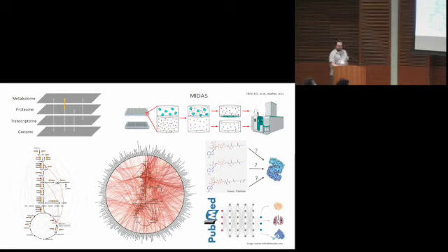And so you can imagine that we're screening 400 metabolites versus I think we're at like 200 or 300 different proteins. And this is going to expand. I think you're in the process of building that metabolite library up to over 600 metabolites. And so the visualization challenge becomes an issue. And that's what I've really focused on with this project, is building a visualization and analysis platform to enable interpretation of this data set, or of these data sets.